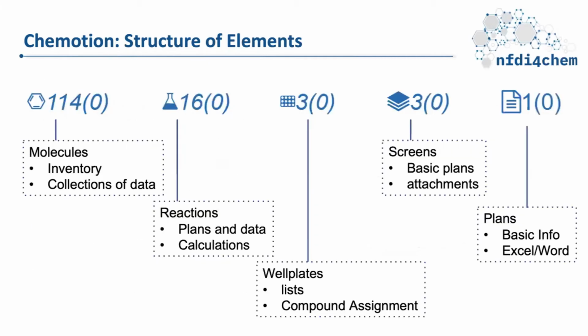So this is a different view of the elements that I have discussed before, where you have molecules and you have reactions, well plates and screens, and then there are these project plans.